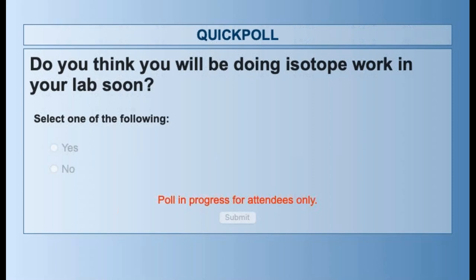Really, the most important thing here, as with everything ICP-MS, is prep. And I really, really do think it's prep. I think that the ICPs, and the latest versions of quad ICPs, are certainly sensitive enough and certainly fast enough that they can handle isotope ratios.